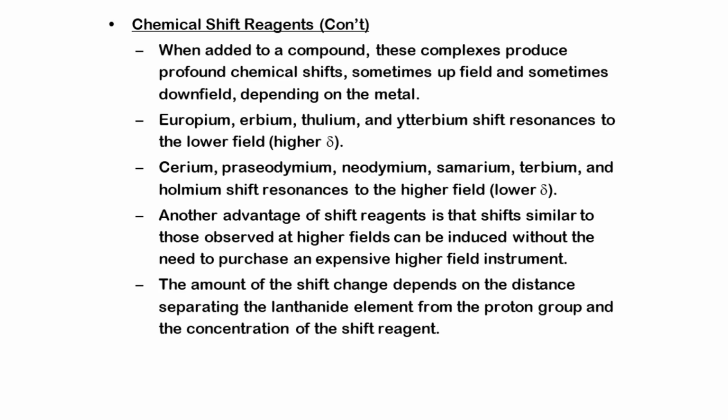Another advantage is that shifts similar to those at higher fields can be induced without needing an expensive higher field instrument. The shift change depends on the distance between the lanthanide element and the proton group, and the concentration of the shift reagent.